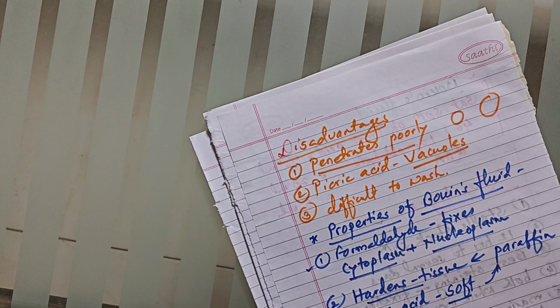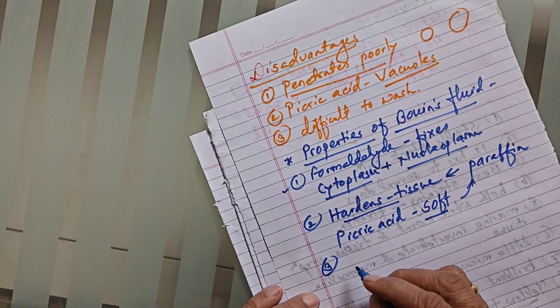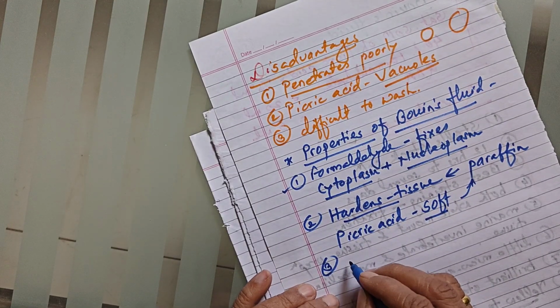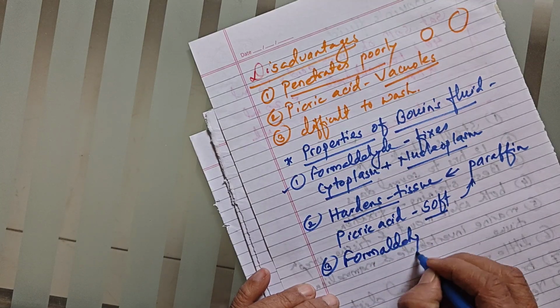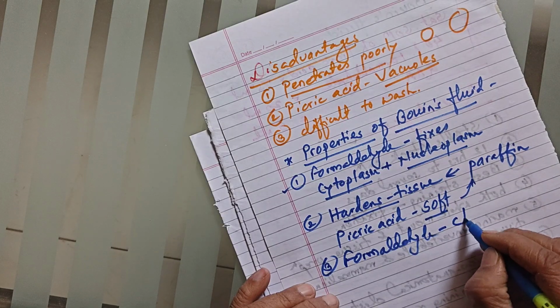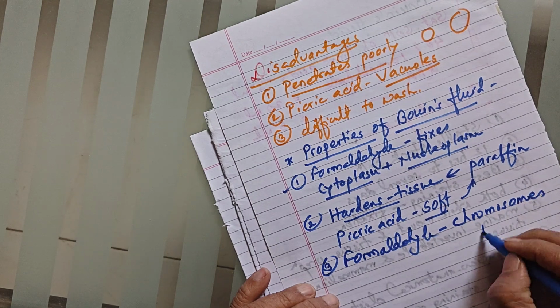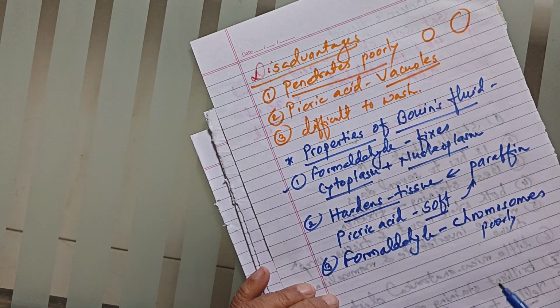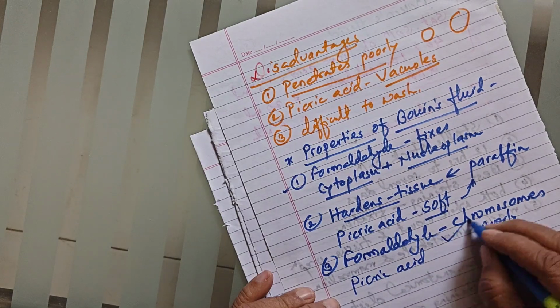The third property: in this Bouin's fluid, formaldehyde fixes chromosomes poorly. That is, it does not have the ability to fix the chromosome properly. But the picric acid fixes chromosomes very well.